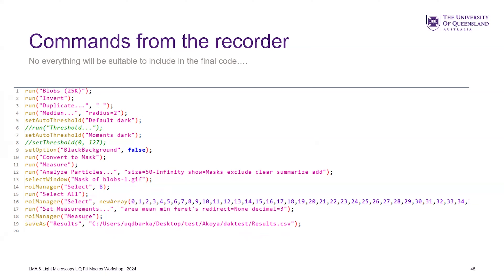Now this probably won't run if you just jot that straight into the Fiji macro, but you probably don't know what the Analyze Particles command with size 50 to infinity looks like as an actual command string. If you just copy that bit into your loop or something, it'll work.